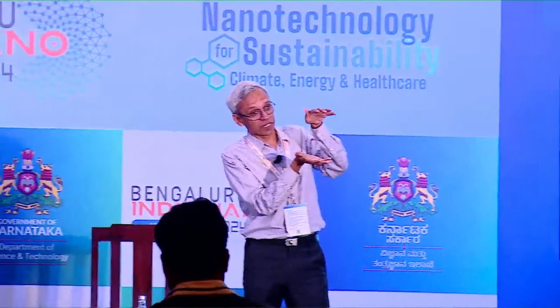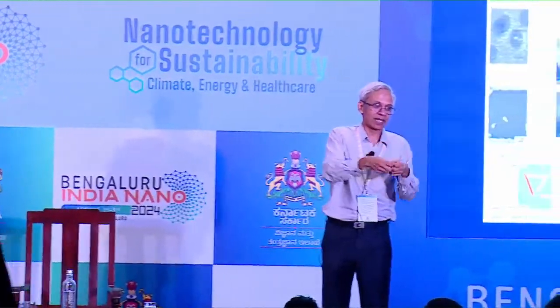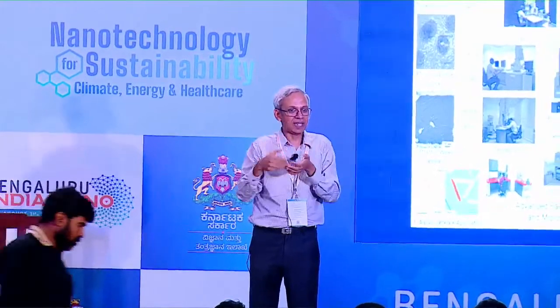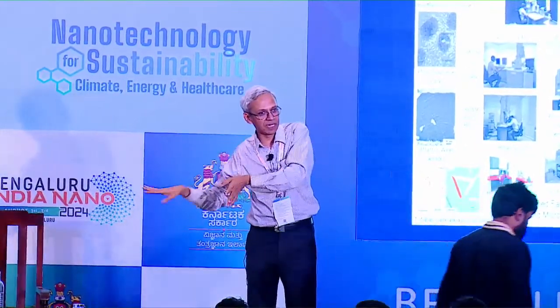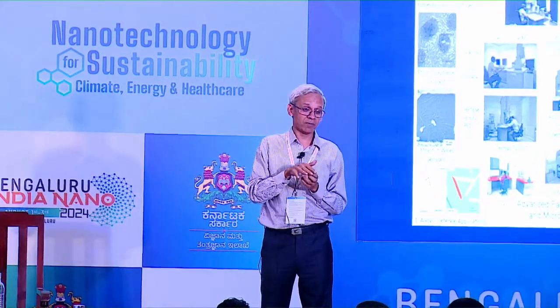So what are the complications with magnetic samples? That's a good question, important question. Remember, your specimen is sitting within the magnetic field of the objective lens. If it is strongly magnetic and it's not strongly bound to your holder, it can go and stick to the lens. Your objective lens is gone because the field will now get distorted, and later everything that you do will be a problem. Therefore, that is a big problem.